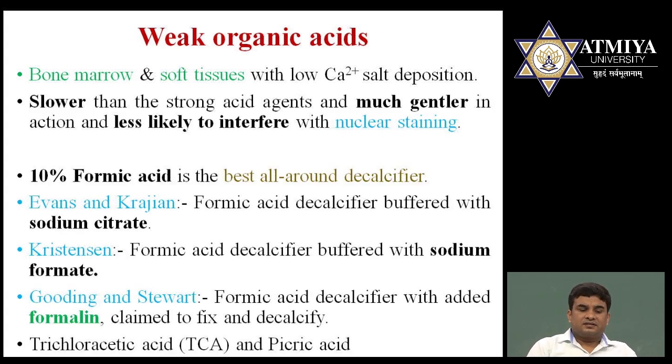In this case, there is formic acid in a concentration of 10%. It is the most commonly used weak organic acid. It is an all-rounder decalcifier, you can say.